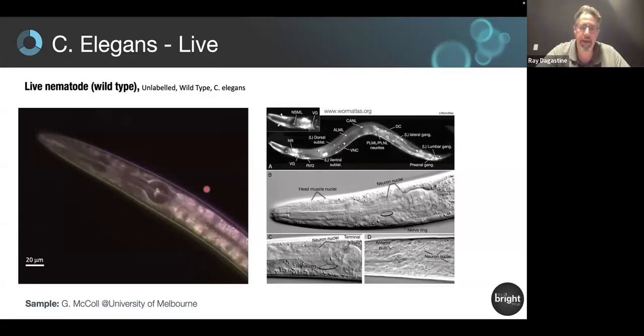There's no reason this actually can't mount on a stereoscope. We're really curious about some things about looking at this, can it help in IVF or ICSI or things like that? Or looking at lower magnifications than say a 40x, where you're actually getting a lot more detail even at a lower magnification.